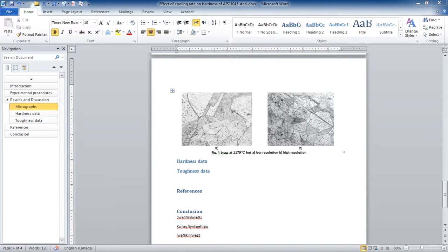Okay, this is part 4 of the series of videos that I've been recording for writing a lab report effectively. And in this part, I'm going to talk about how to show your micrographs properly. Now, the problem that we may have with micrographs is this.